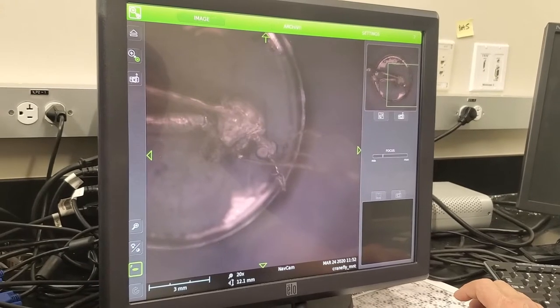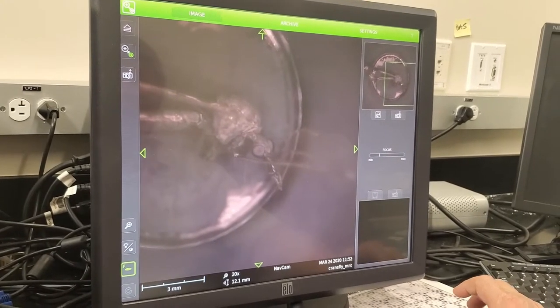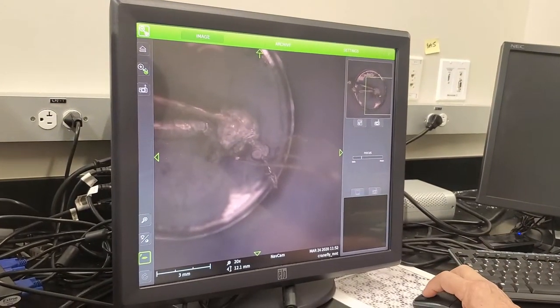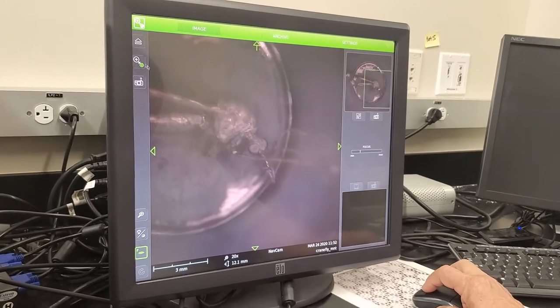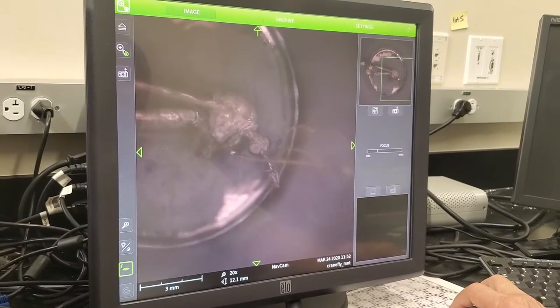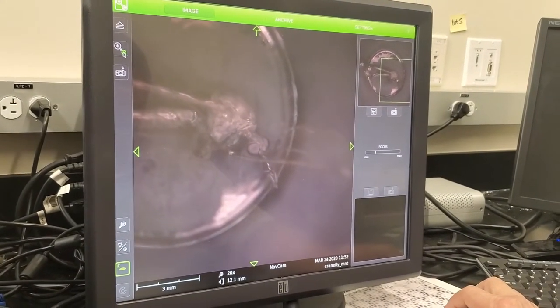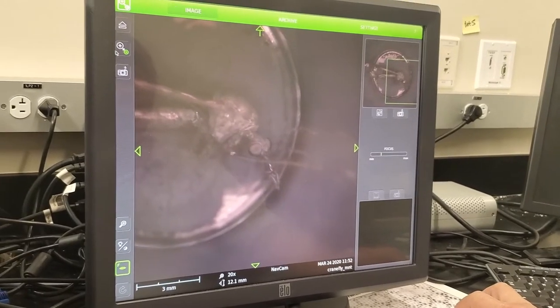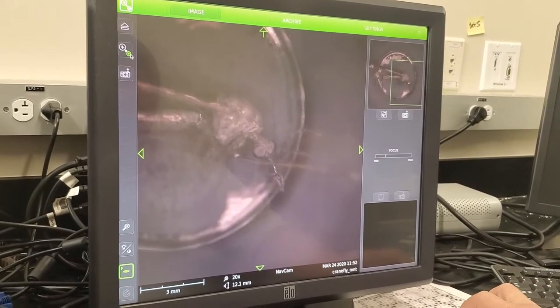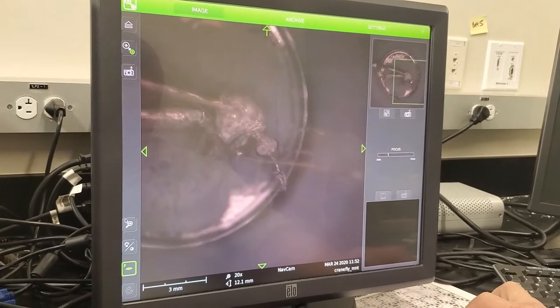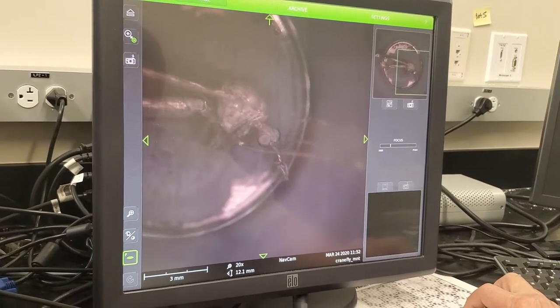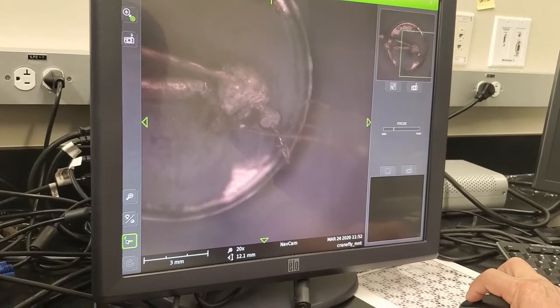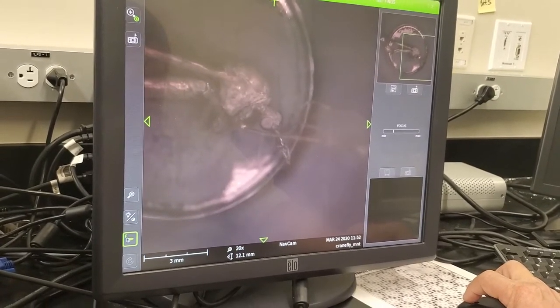Now normally it takes about five minutes, but I already waited the five minutes. Remember here — that tells you that the SEM is ready as well as the optical microscope. So remember: taking a picture involves SEM, optical microscope, magnification, brightness, contrast, and focus.